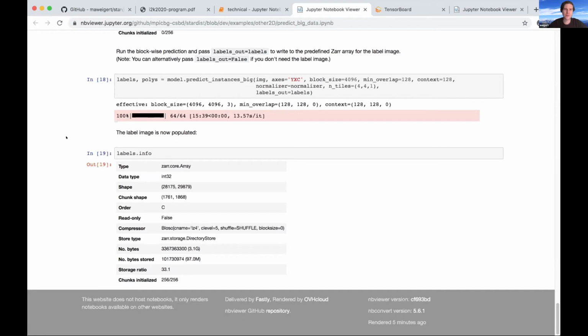So people actually did that. Olivier from EPFL last time mentioned that what they used at the end was they tried fine-tuning, and that worked okay. But what worked the best was just using the original data set it was trained on and putting your own images into it, which sounds like not the correct way. This works if your data is similar enough, I think. It's not always the best way, but it could be.